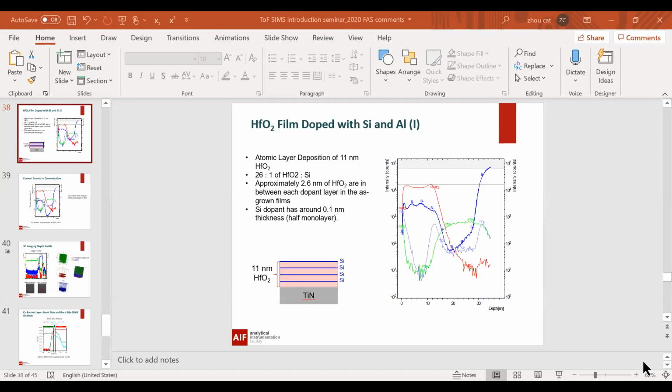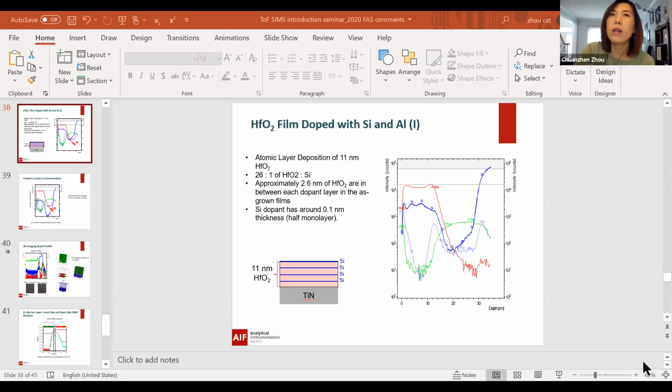Let me throw out another interesting question here. What has been done concerning static SIMS and standards? You mentioned use of standards for depth profiling. Has anyone really delved into the question of surface scans and standards? That's a really difficult question, a very different problem to solve. But one thing you can do is incorporate an internal standard into your sample.